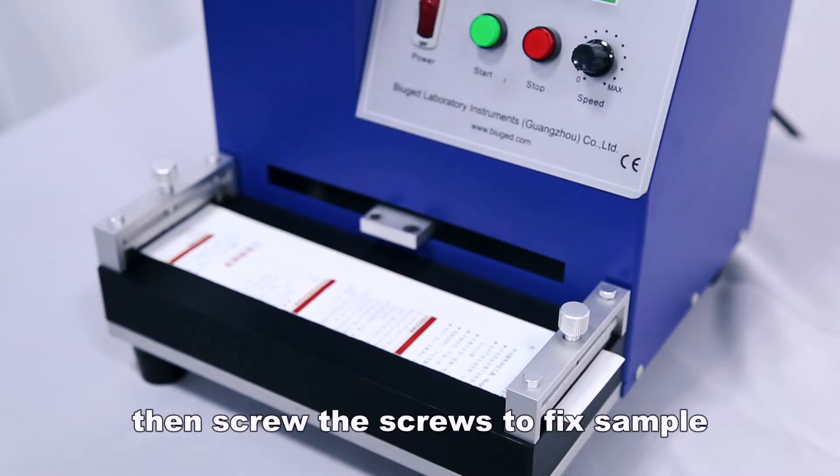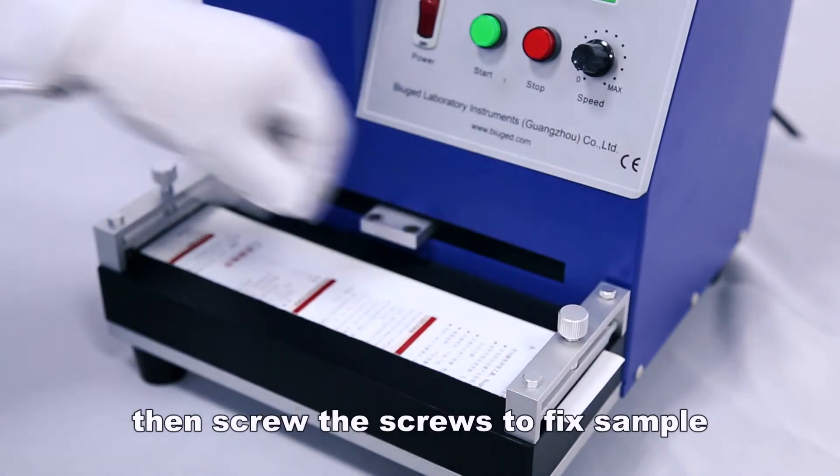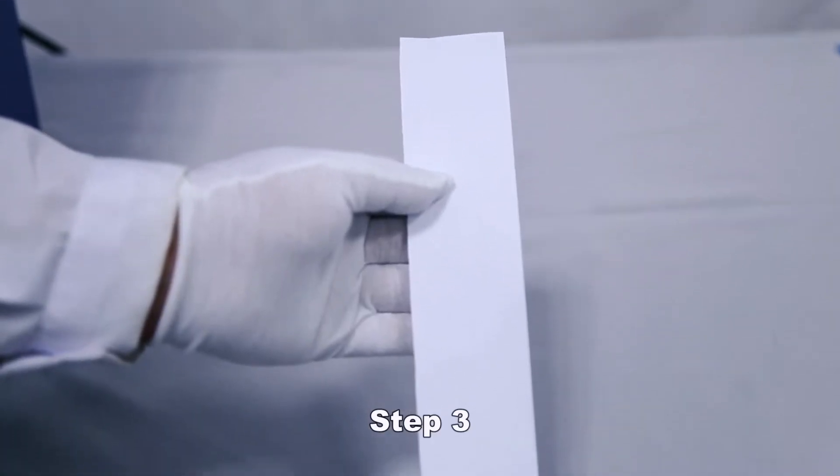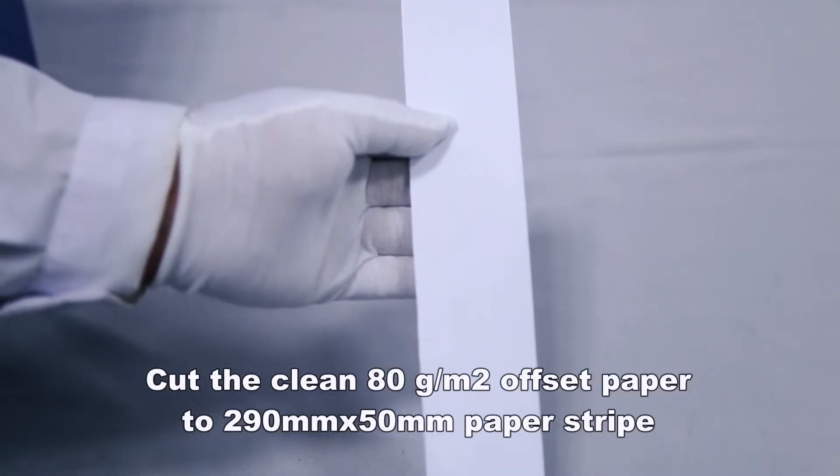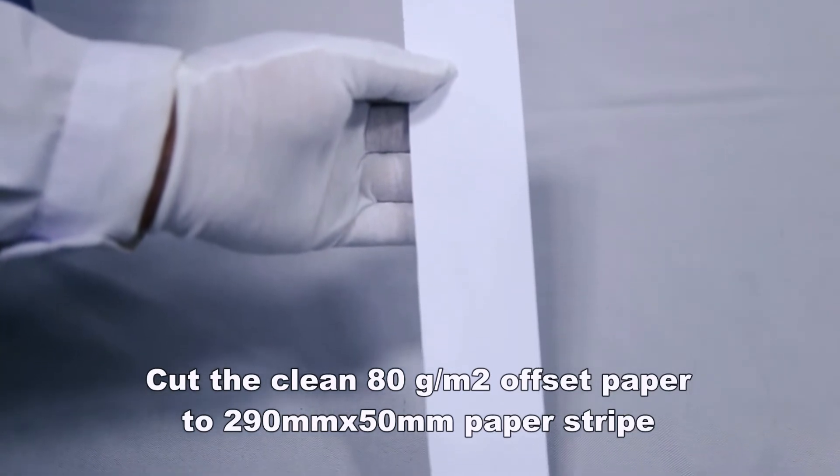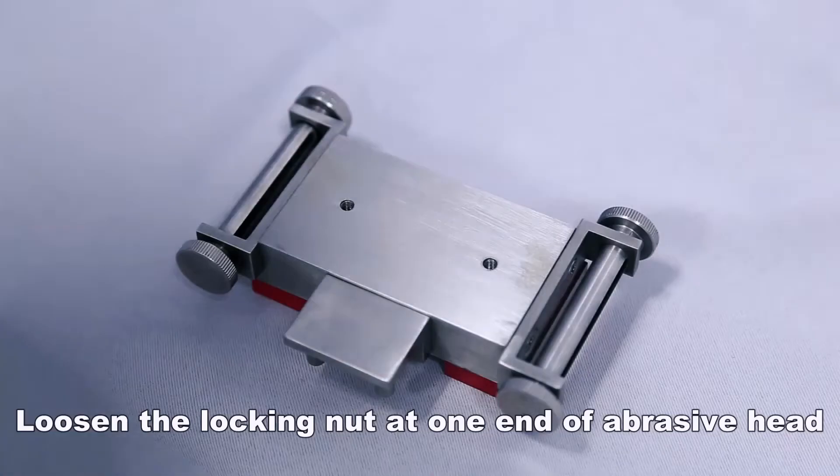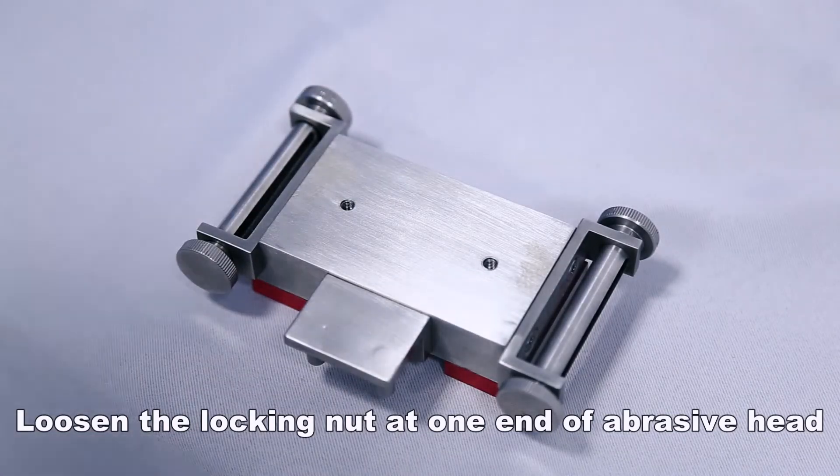Then screw the screws to fix the sample. Cut the clean 80 grams per square meter offset paper to 290mm x 50mm paper stripe, which will be used as abrasive medium. Loosen the locking nut at one end of the abrasive head.